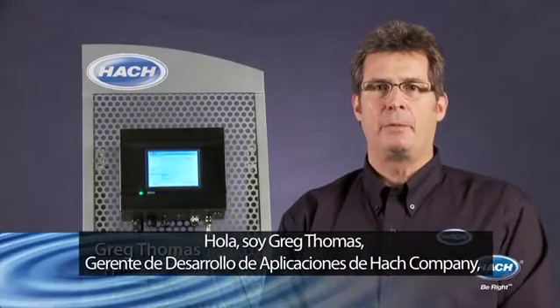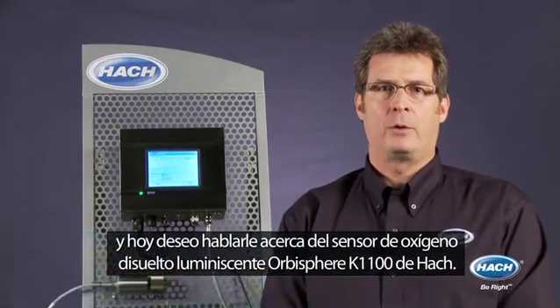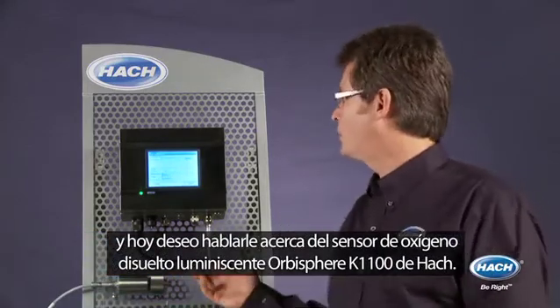Hi, I'm Greg Thomas, Application Development Manager for Hach Company. And today I'd like to talk to you about the Hach Orbisphere K1100 Luminescent Dissolved Oxygen Sensor.